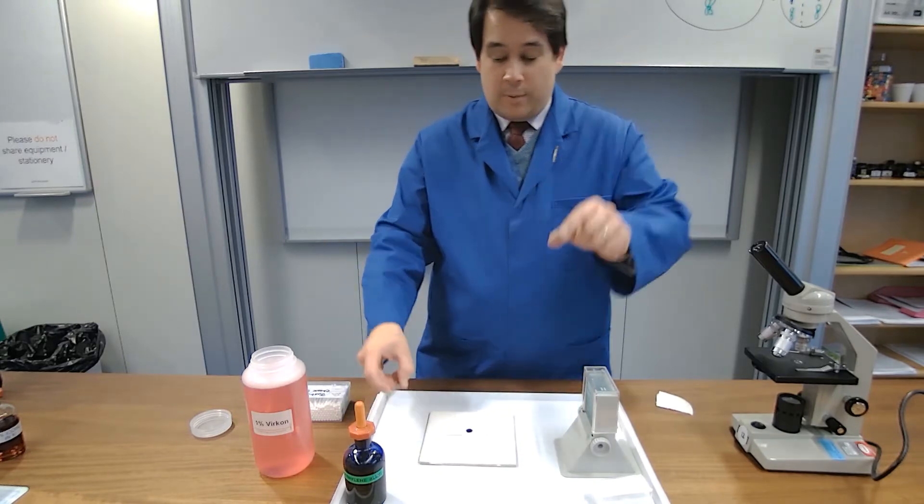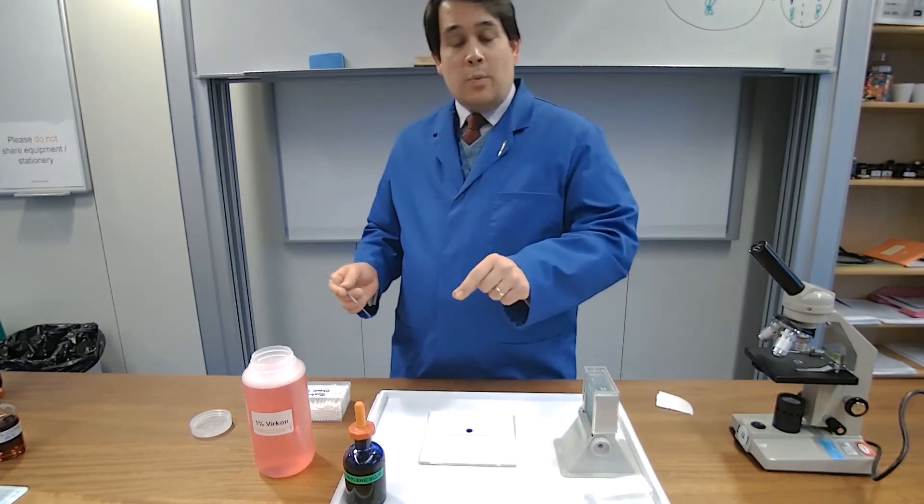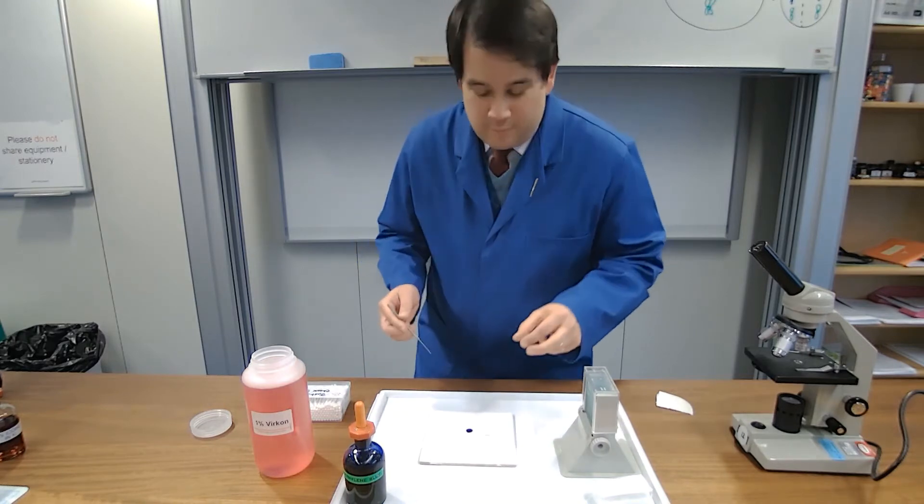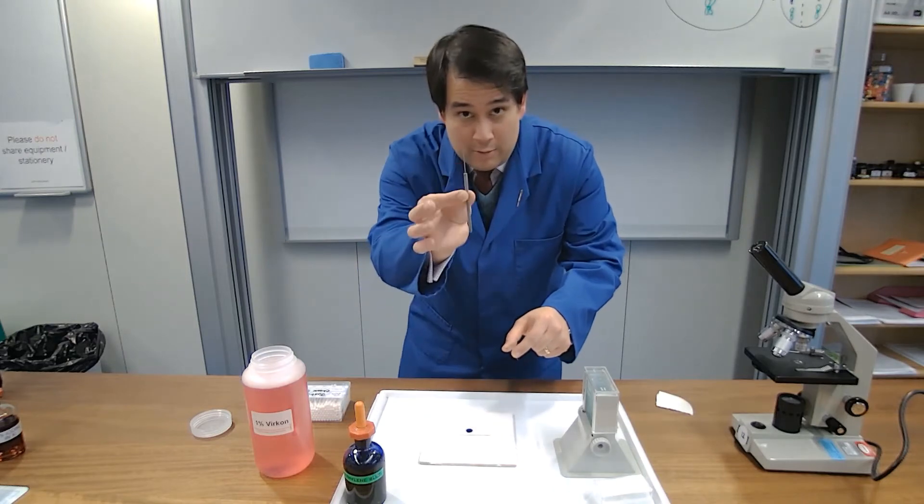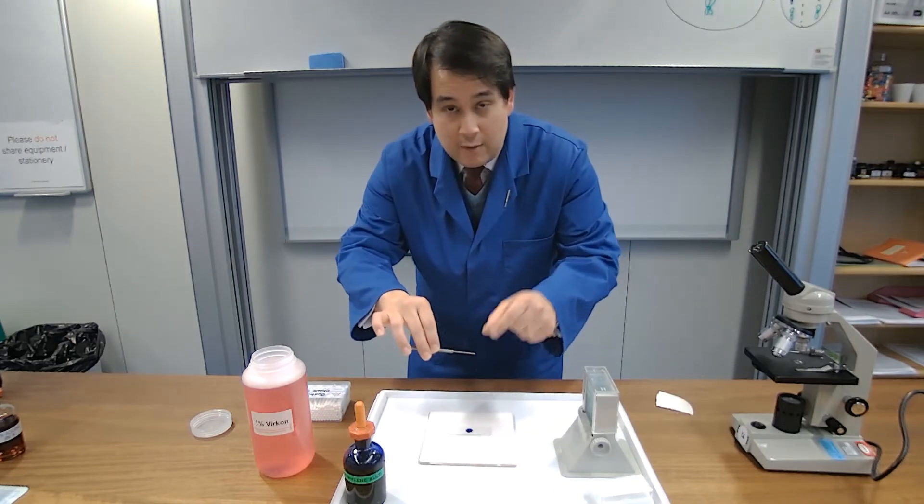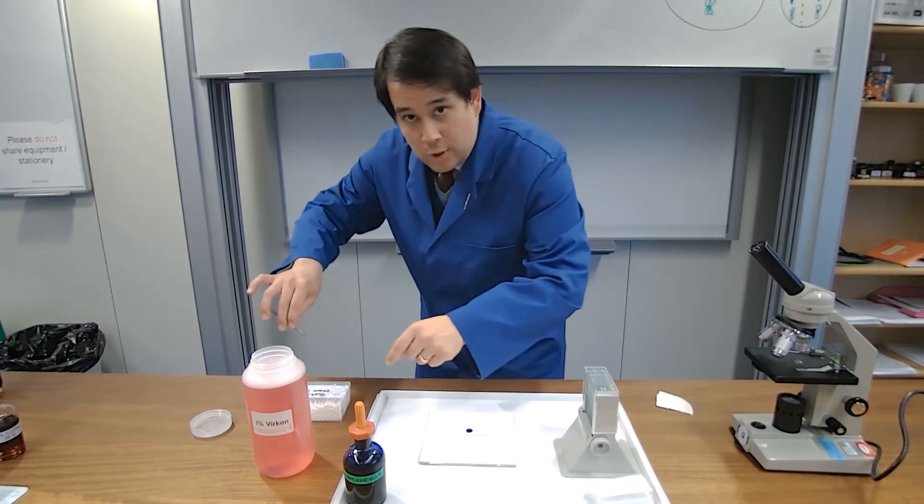Now, you need to be careful about the cover slip. If it goes on straight away, you can add some air bubbles which will make things look a bit more difficult. So what we're going to use is this technique where we use a mounted needle to rest the cover slip on and then we lower it slowly onto the bubble.